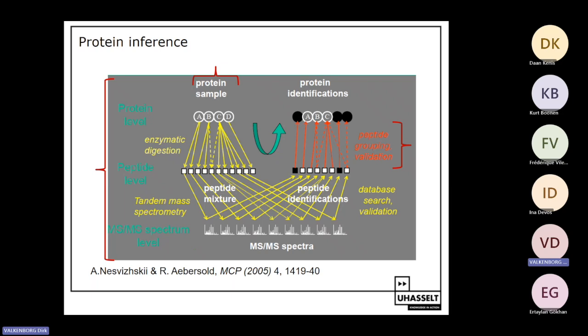Typically, it boils down to solving some type of constraint satisfaction problem, a complicated problem to balance out and figure out what is the list of most probable proteins that could give rise to this selection of peptides. So very interesting procedure possible in protein inference, but you can attend an entire course on this subject alone.